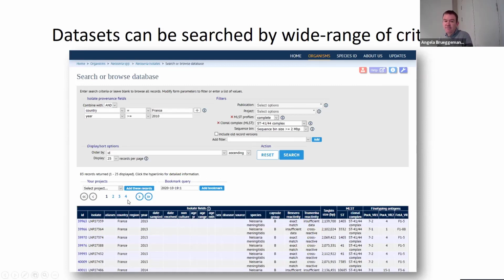And then once you do that, you click search and you'll get your results table. And there'll be certain fields displayed by default. These tend to be the ones which I've deemed most useful. Other people might disagree, but if you disagree, you can customize it and set whichever fields you're interested in displaying within that data set. And all of these records are hyperlinked, so you can click the hyperlink and it will take you directly into the item record that we just saw.